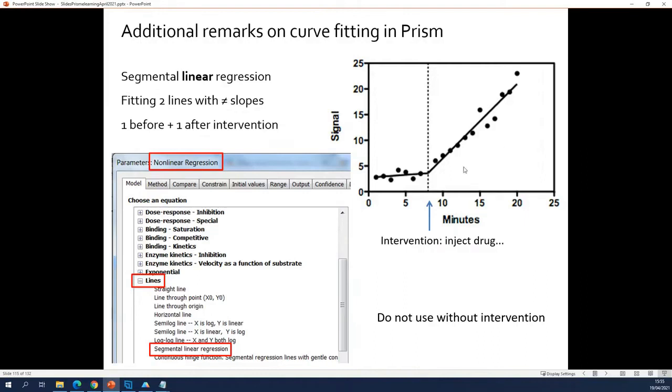Only do it when you effectively do an intervention. Not when your data looks like this. So let's do this.